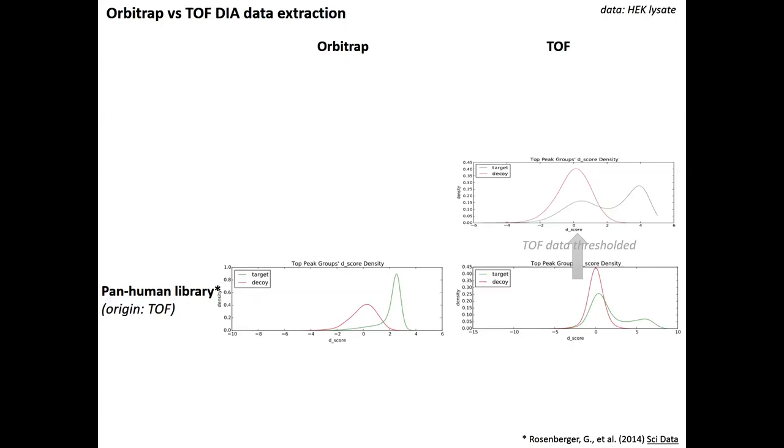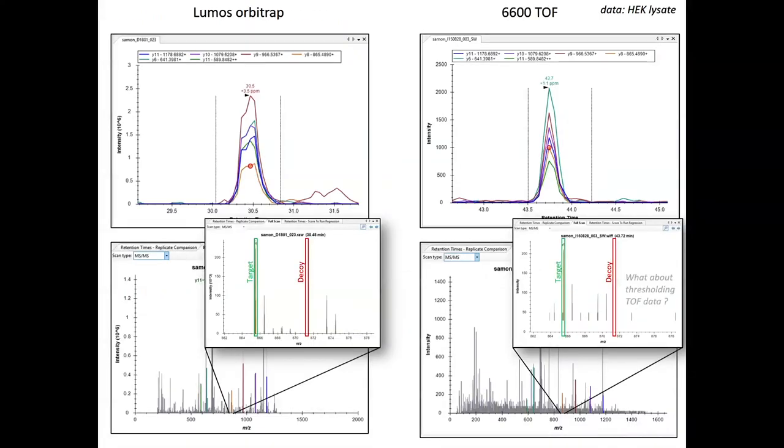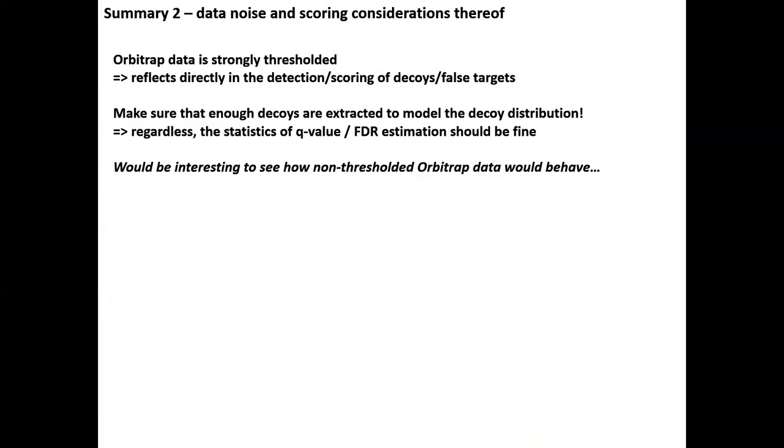So we discussed this extensively internally with George, with Hannes, with Ben, with all the people involved in this type of statistical estimation and how it can hold, etc. We still believe that most of our tools will hold and manage still to get this FDR estimation correctly on these pictures, especially because, as I showed you in the picture before, the decoys and the target are treated the same way. So if you have no noise to extract for the decoys, there is no noise to extract for the false targets. So as long as you treat both species the same way, and as long as you don't bias the measurements one way or the other, I think all what you've seen this morning still holds true, and you can still use most of these calculations for this analysis. So this is my conclusion for this part.